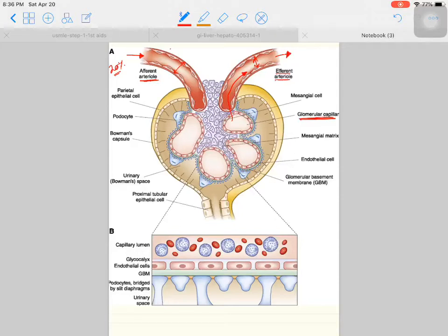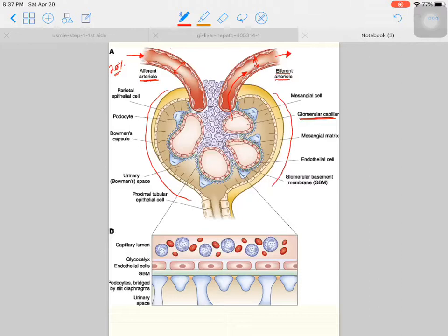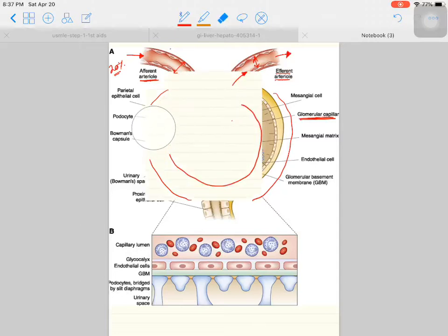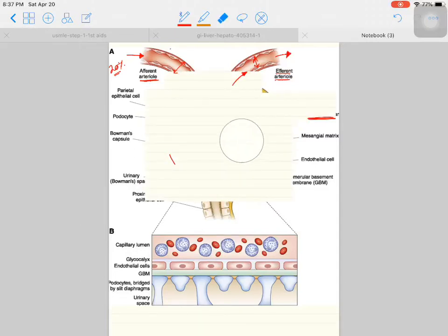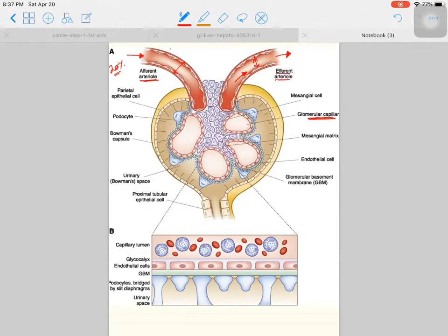Let's discuss the structure of the glomerulus one by one. The glomerulus is part of the glomerular corpuscle, which consists of first the Bowman's capsule and then the glomerular capillaries inside.